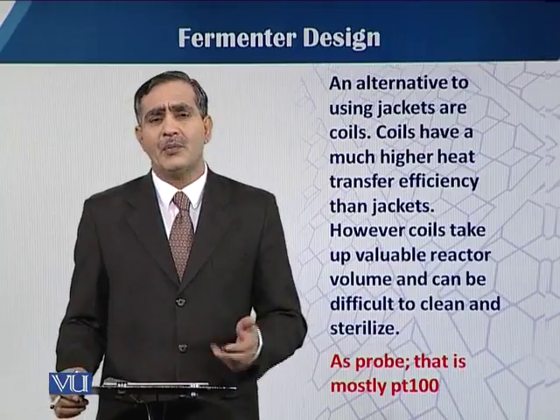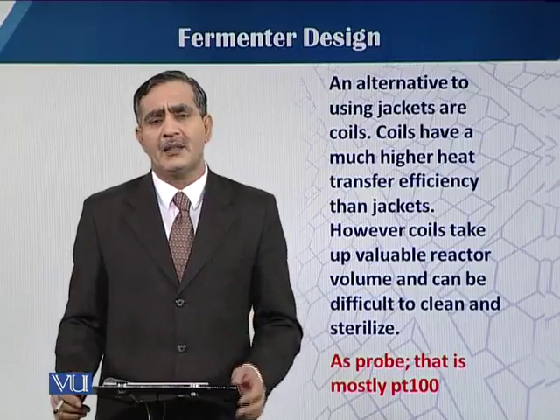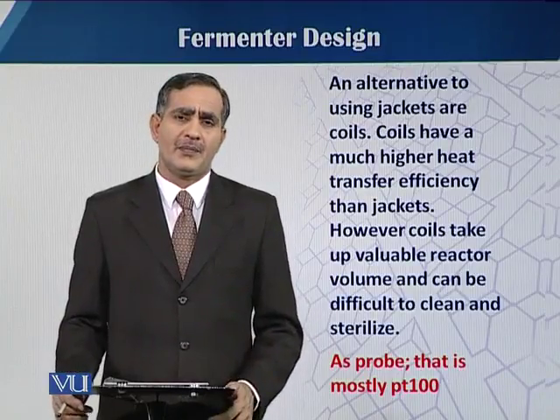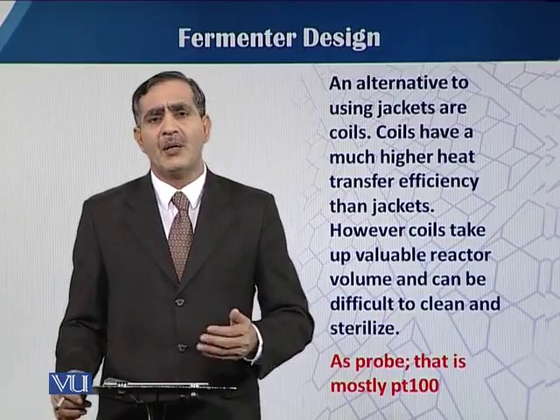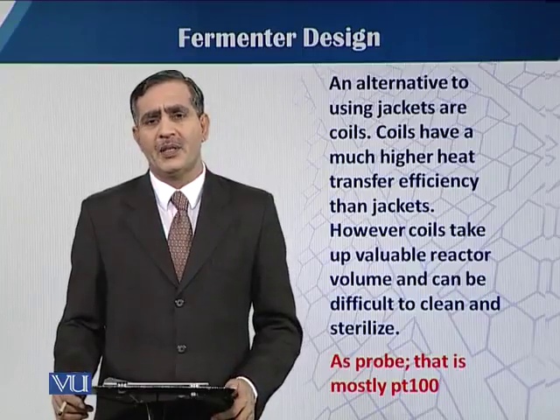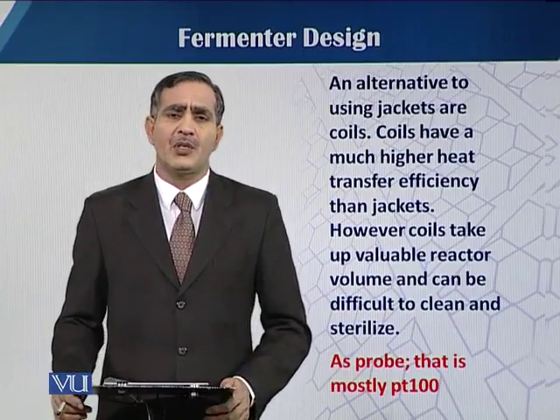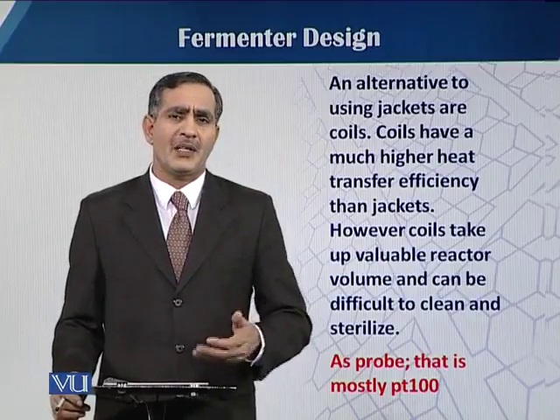As concerned the probe, in most fermenters the PT100 temperature probe is mostly used. What is PT100? We will talk about it later when we discuss the design of the probes. The PT100 is mostly the probe used to sense the temperature inside the fermentation vessel.